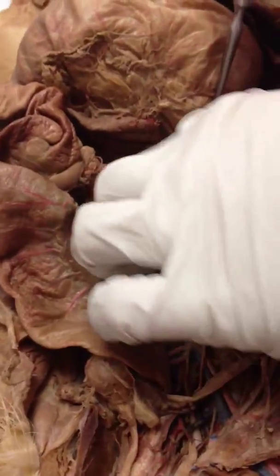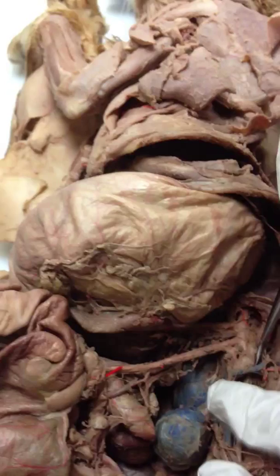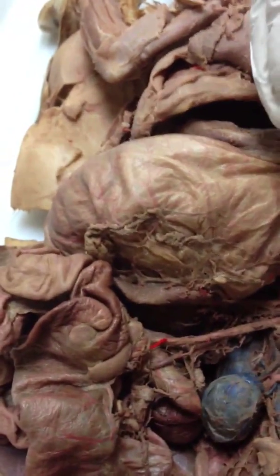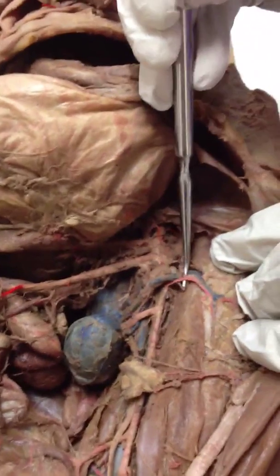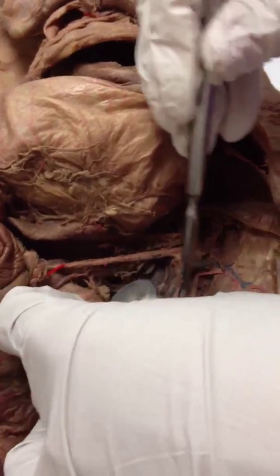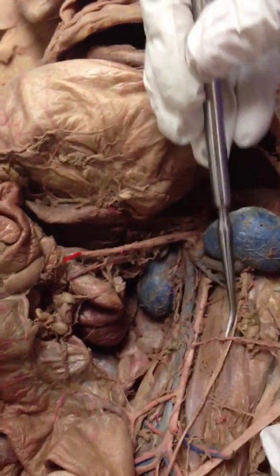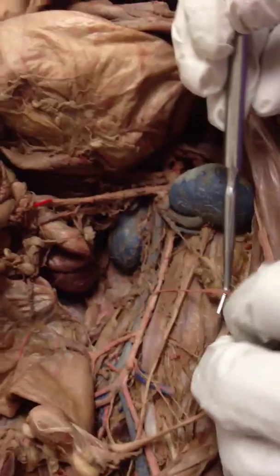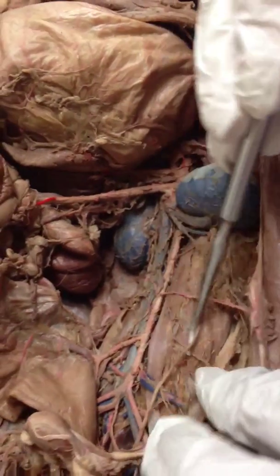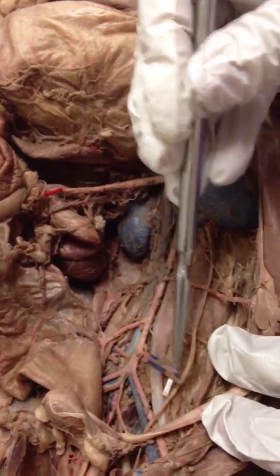Alright. Now we go to the paired arteries. First we would see the adrenolumbar. It would be above the renal, so it would be this one right here, the first branch on the left. That's the adrenolumbar coming into the adrenal glands and then the muscles of the lumbar. The renal arteries go to the kidneys. Then we would see the gonadal, and if it's a female, it would be the ovarian artery. And then the very last one is the deep iliac circumflex.